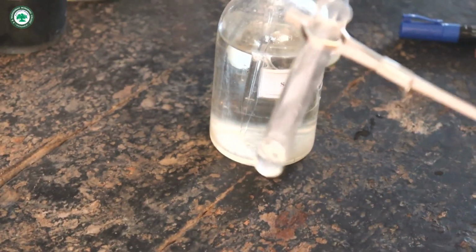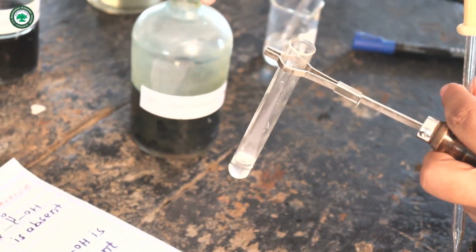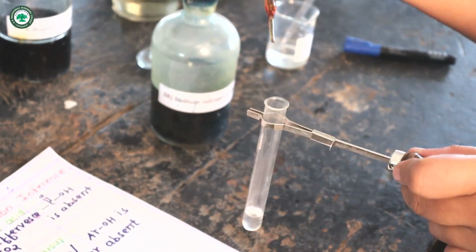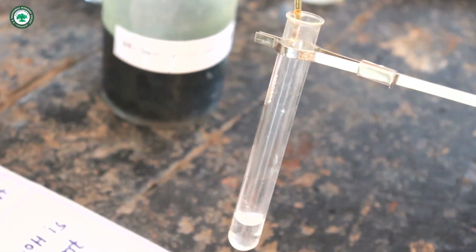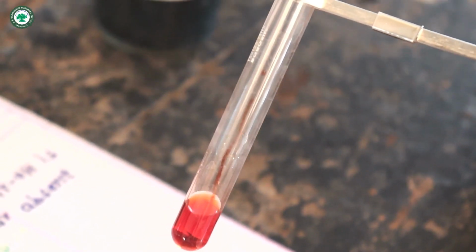Then add sodium nitroprusside solution, only 1 to 2 drops. If blood red coloration appears, then ketonic group is present. Blood red coloration appears, therefore functional group of third organic compound is ketonic.